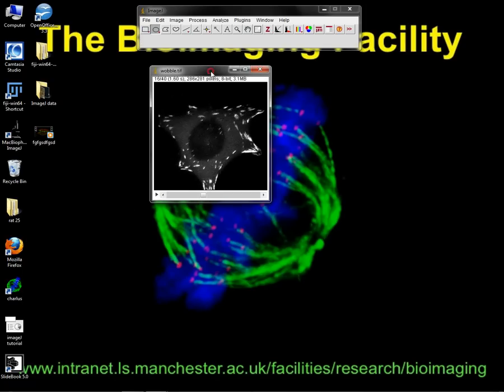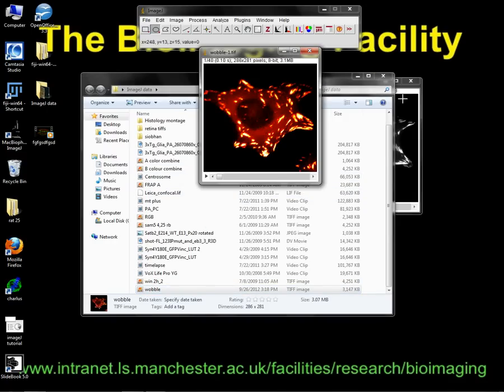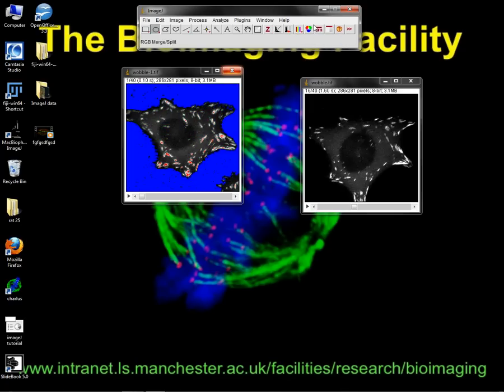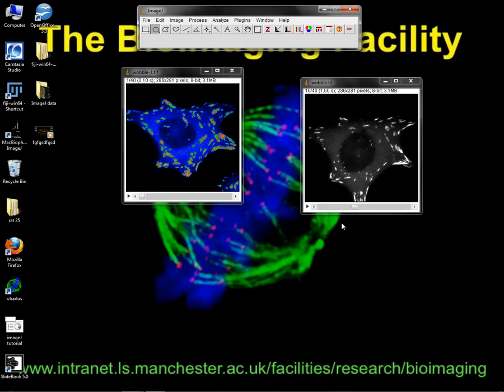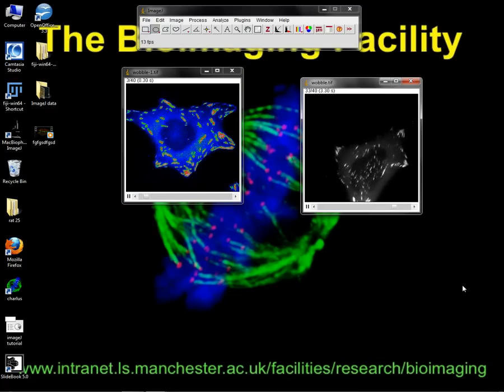If we compare it to the first one, and what color works, let's make that grays so they look the same. So that's where you can choose whatever color. You know, it's like, ooh, magenta. Ooh, red, green, hot. Ooh, high, low. You know, meaningless. It was a black and white camera. We're just applying a pseudo color on top of it. And there's loads there, and there's also loads in the lookup tables, millions and millions. Choose your favorite colors. Okay, and then you can compare that, and it looks stationary.